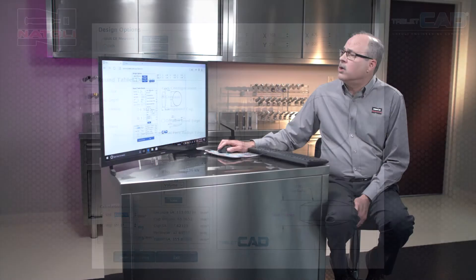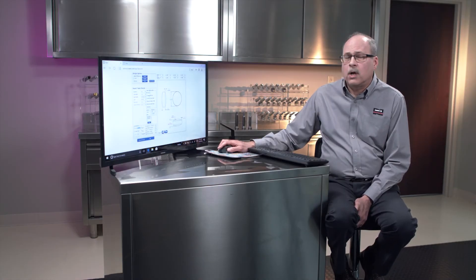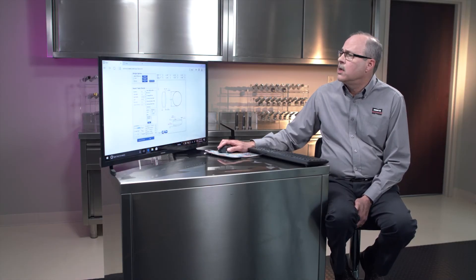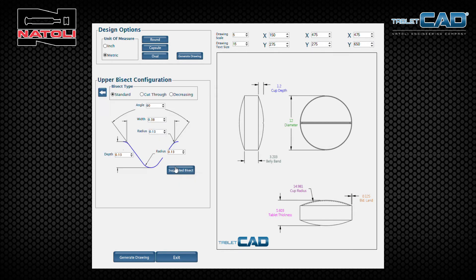Another important feature of Tablet CAD is the different cup configurations: concave tablet, compound cup, concave beveled edge, flat face radius edge, and flat face beveled edge. I want to show you the bisect designs — click on yes for bisect, then click on that arrow.